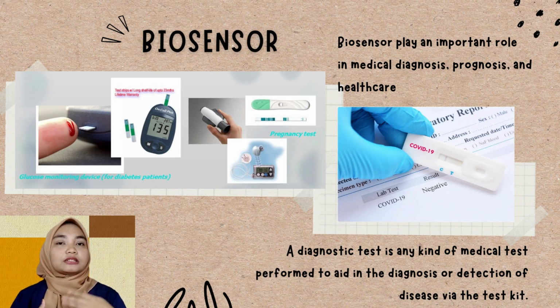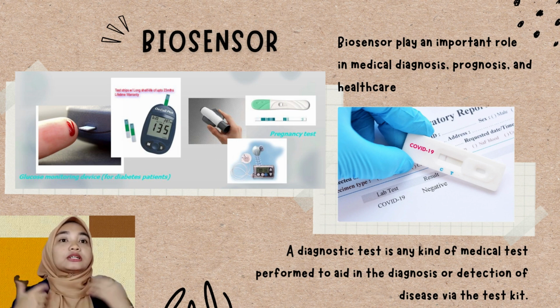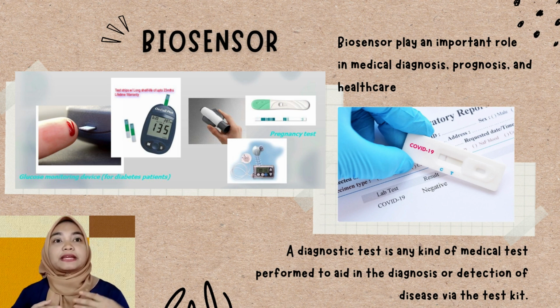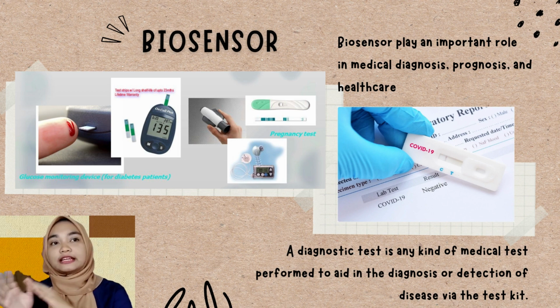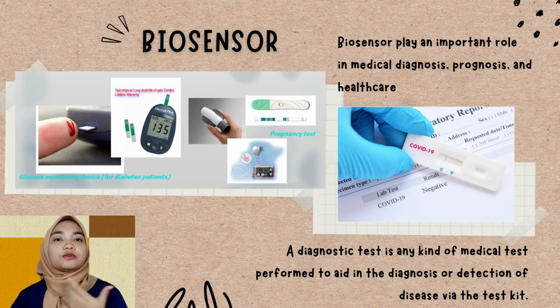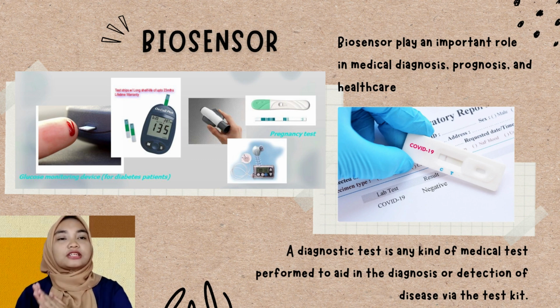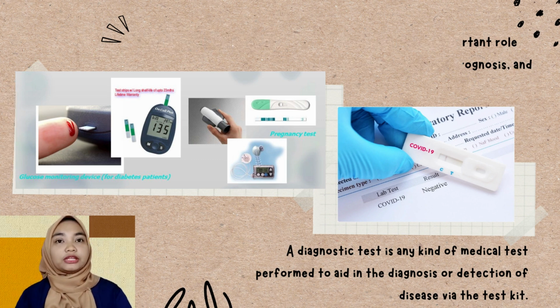For my research, a dot blot assay is used as it is a simple and quick method that may be used to evaluate the effectiveness of antibodies and detection systems. Dot blot assay is less expensive than other methods and allows many more samples to be analysed. Also, the polymeric membrane used for my research is nitrocellulose membrane, one of the most significant and historic cellulose derivatives, and it is usually used in protein blotting.